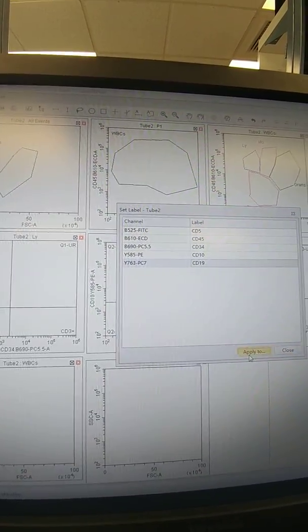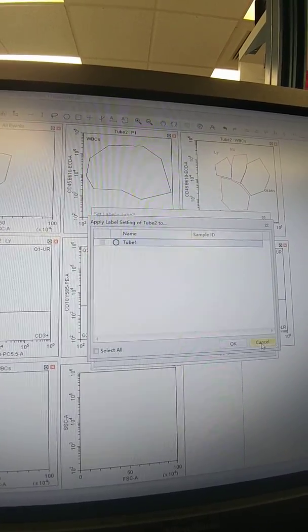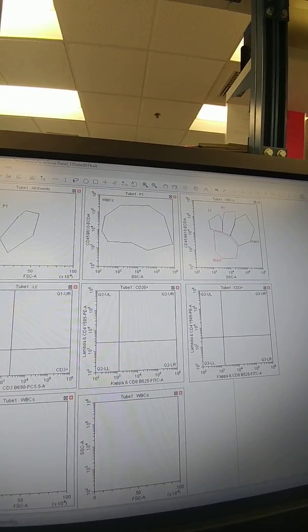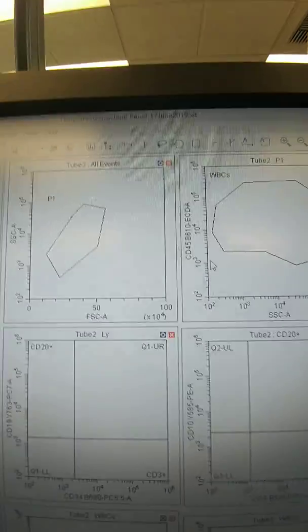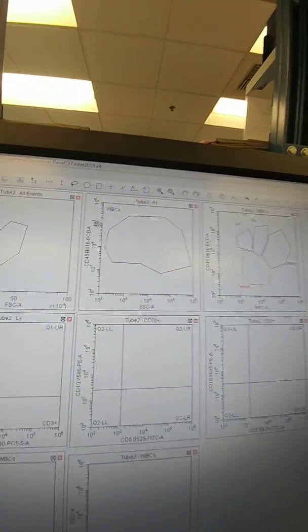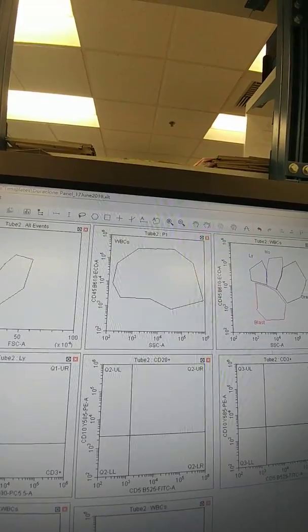Okay. Oh, nope, we don't want that. Cancel, close. Okay. All right. So here we can, well, we'll wait to the end to do that. All right, so now you see up here already that I entered something wrong because we have 45 and 10 in the same.